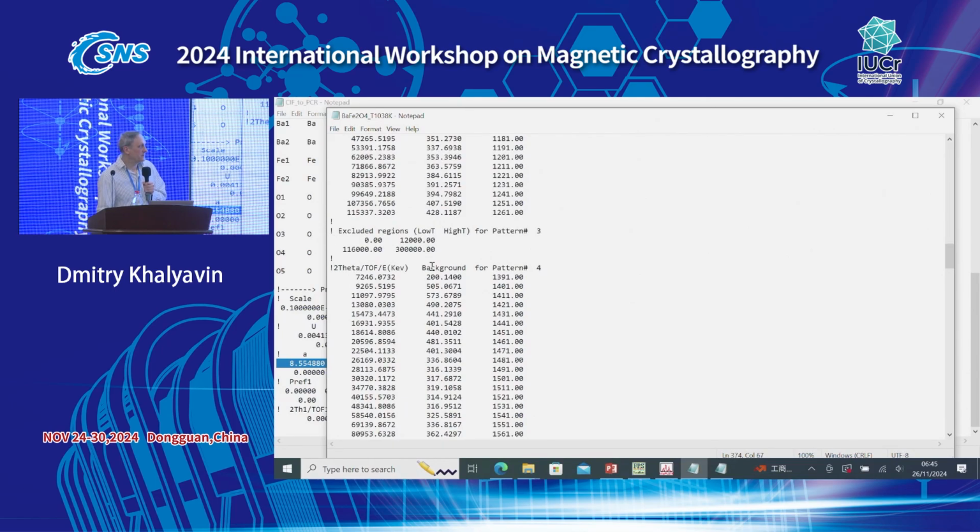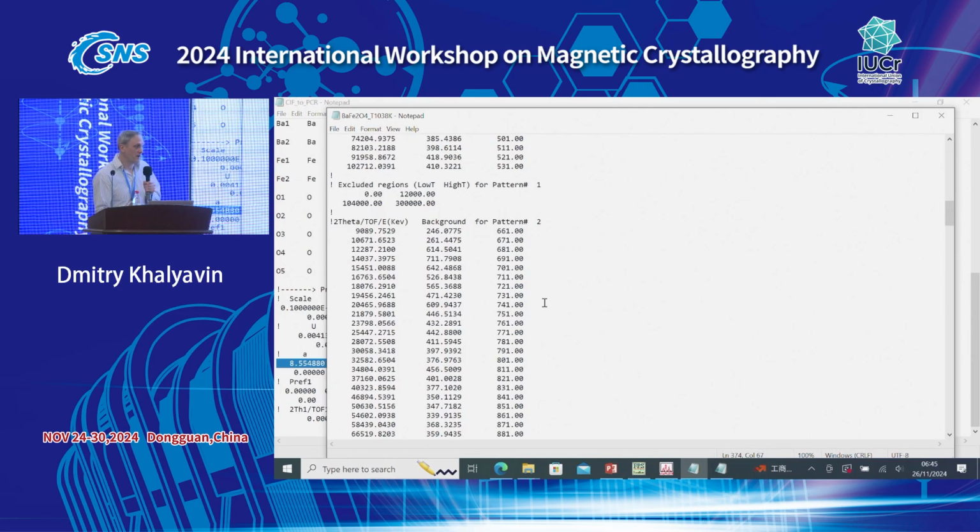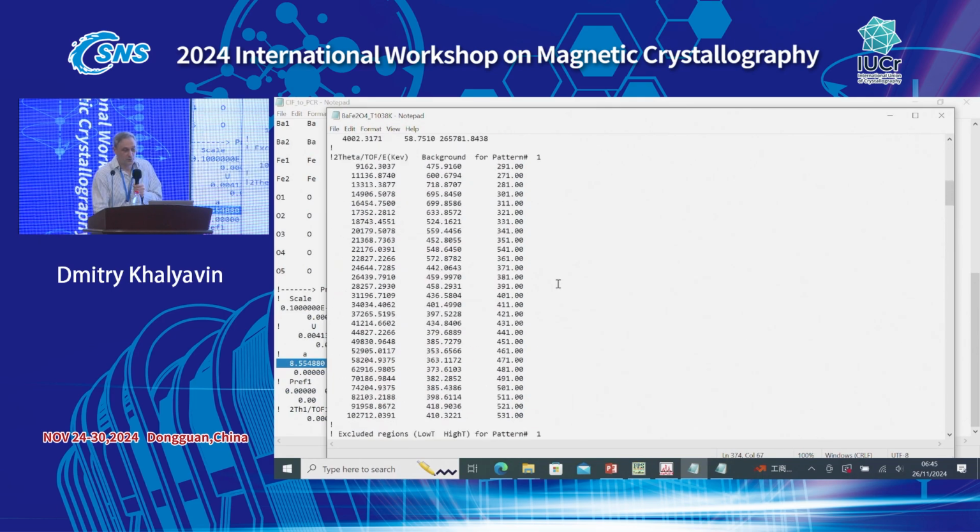Probably there is no golden way, universal for any diffraction and for any case, for any data, which you can follow and get nice refinements. It will be different in every situation. But probably a good practical advice is to always start from refinement of the background and the scale factor at the very beginning, at least. That's what we are going to do.